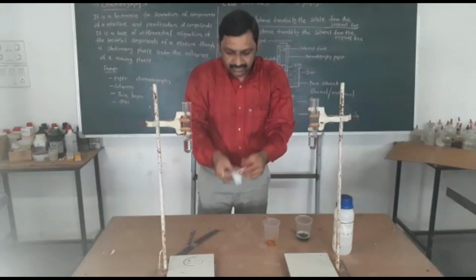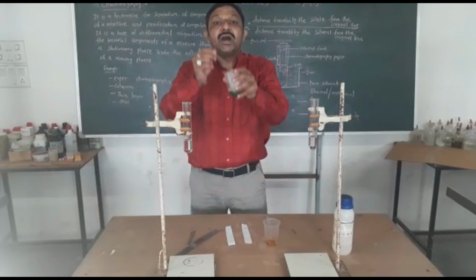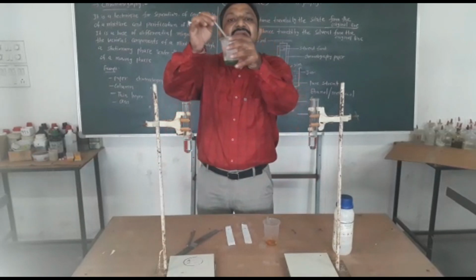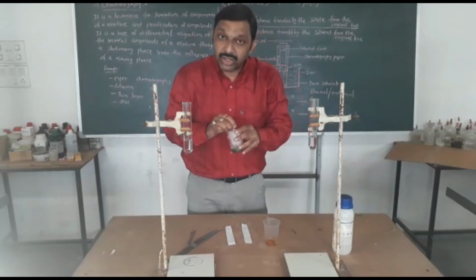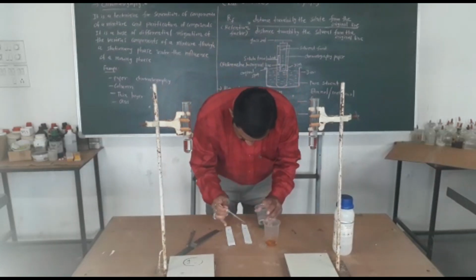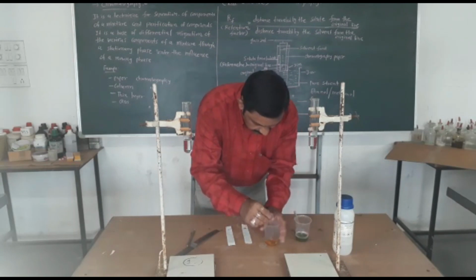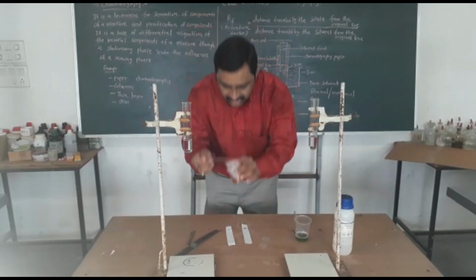Now I will put a spot of spinach and marigold on the middle spot. Here is marigold.